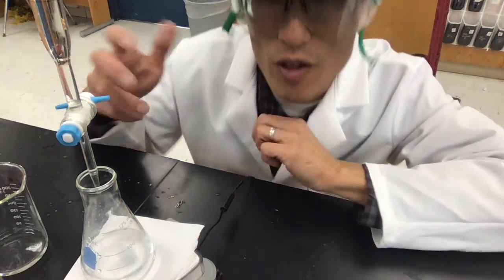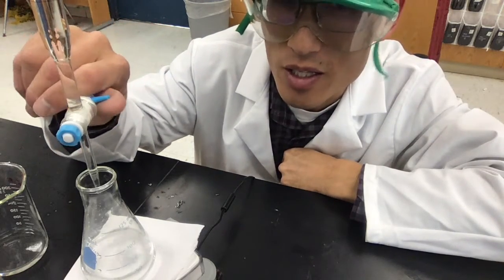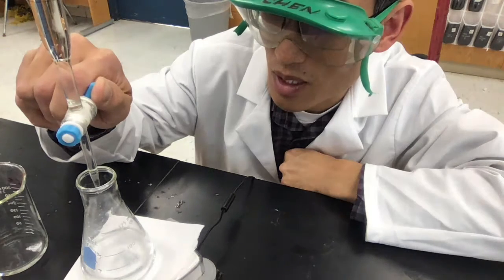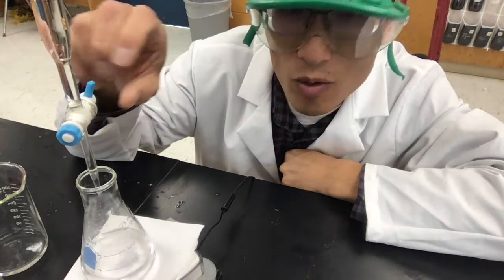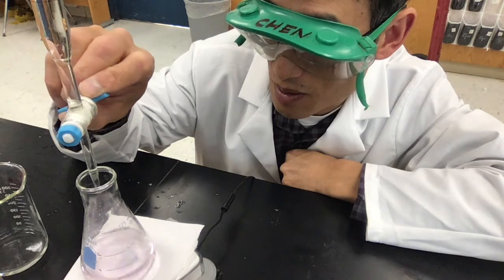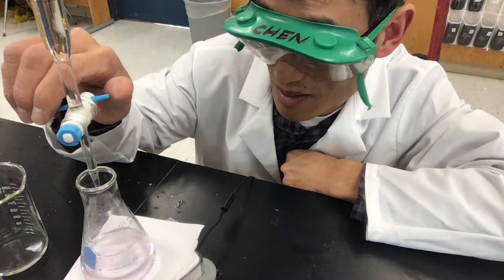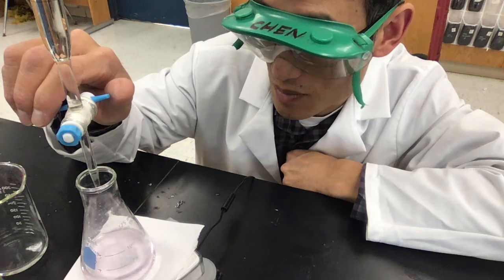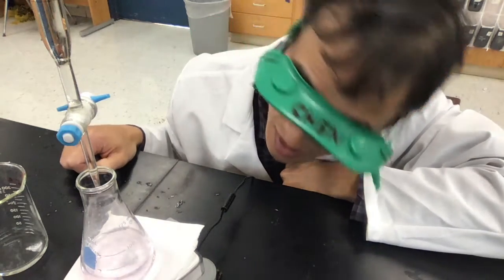Once you do the first run and then you do the next one, and now you're waiting for it to go, you take this and you go drop-wise. You take this and slightly let it drip. See how it's dripping one at a time? Okay, so it's pink. It's like faint pink. Let's see if it stays. And that's staying. So that's okay.